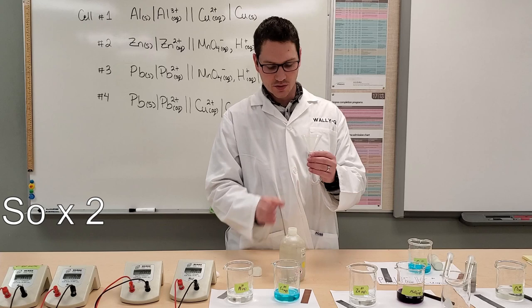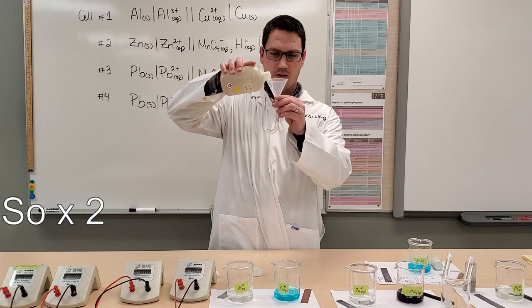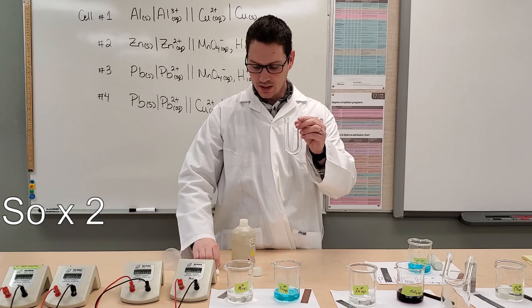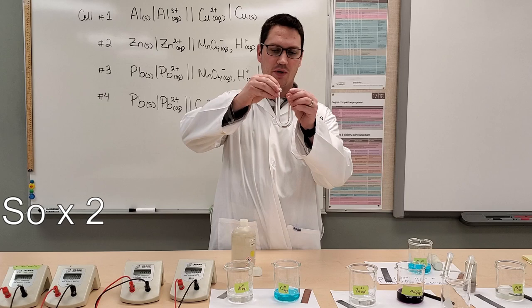This is a little bit of a pain in the butt. But we'll add sodium nitrate to the top. And usually, when we add our cotton, it likes to absorb a little bit of the sodium, so I might have to top it up again here in a second.